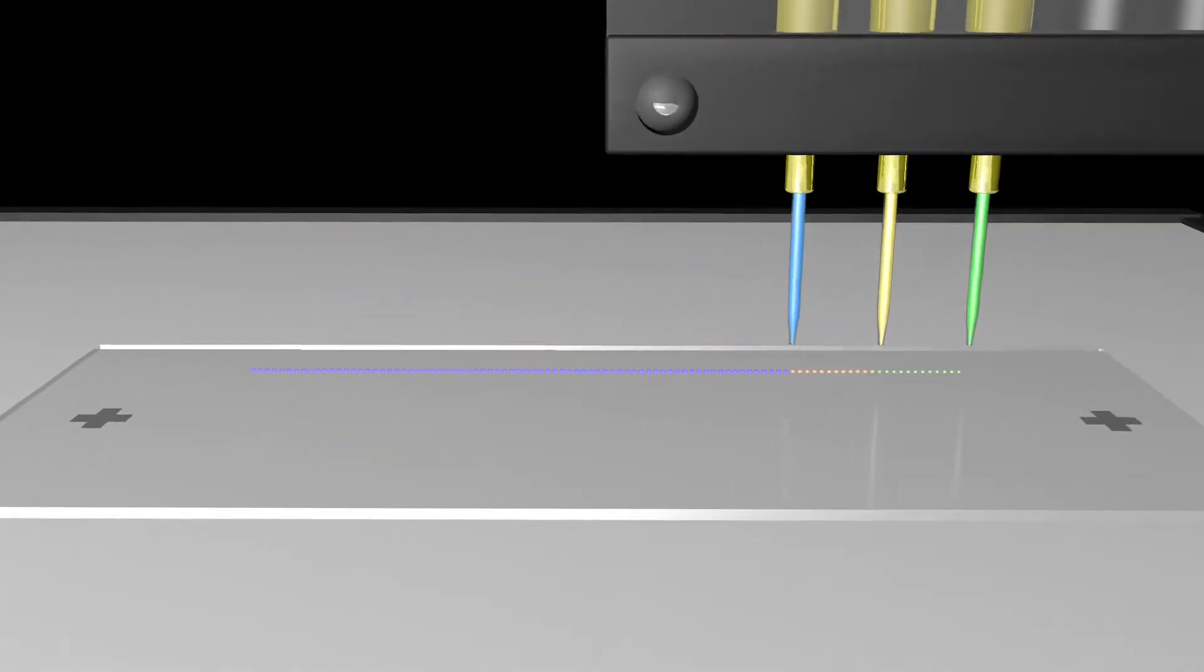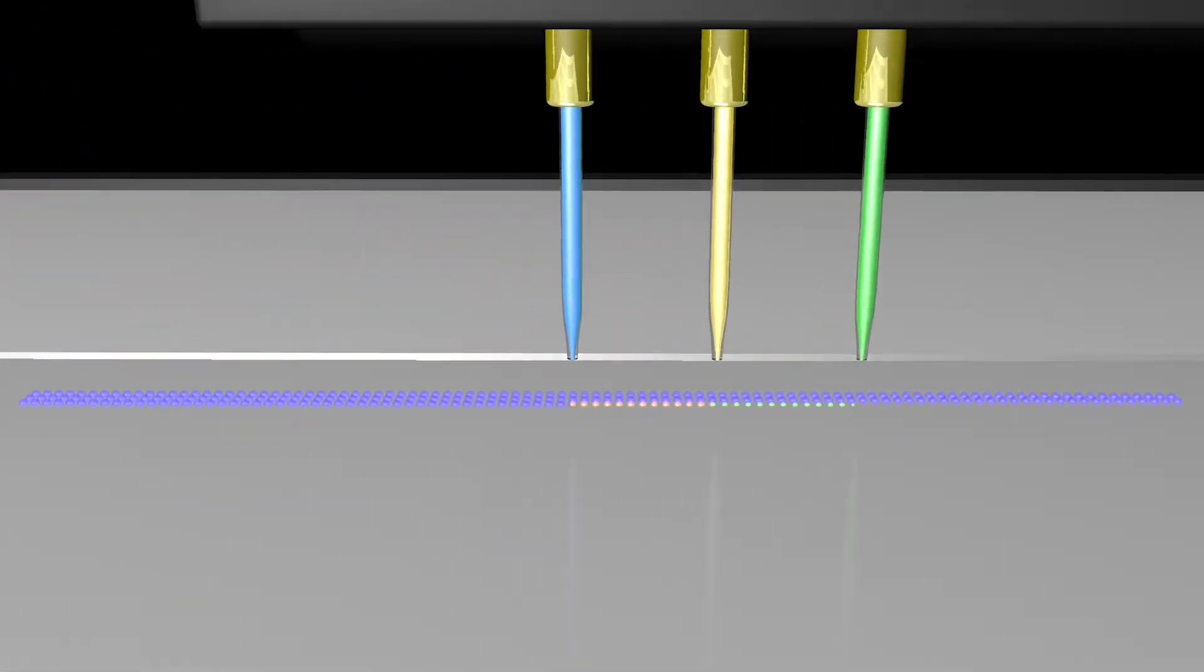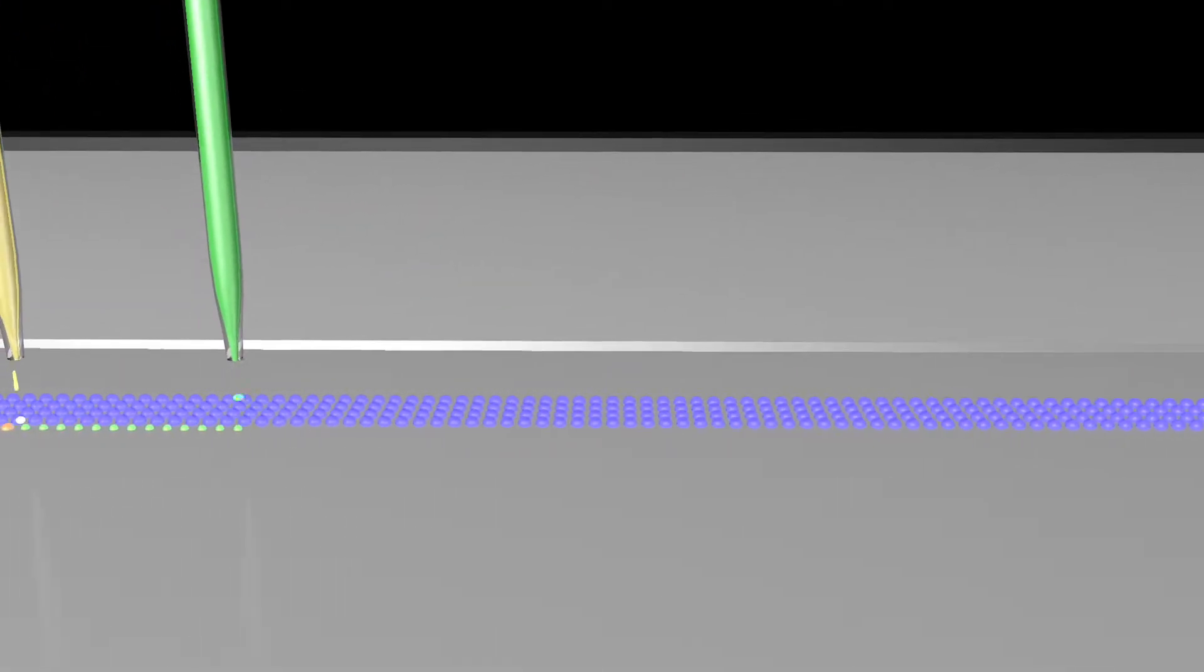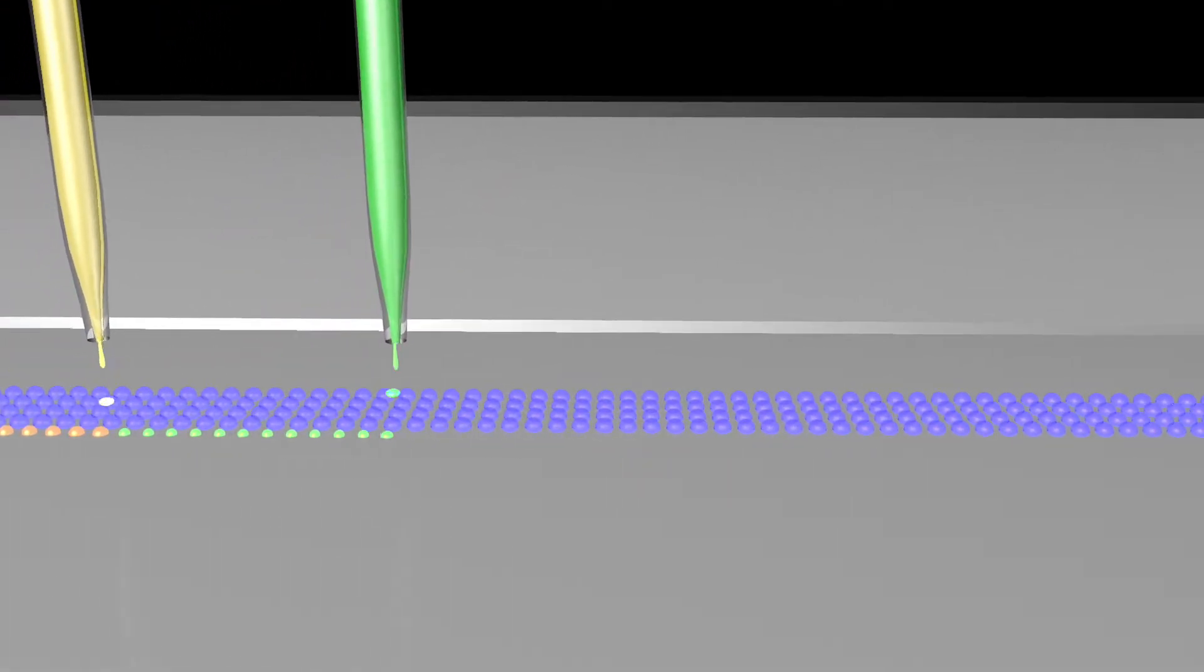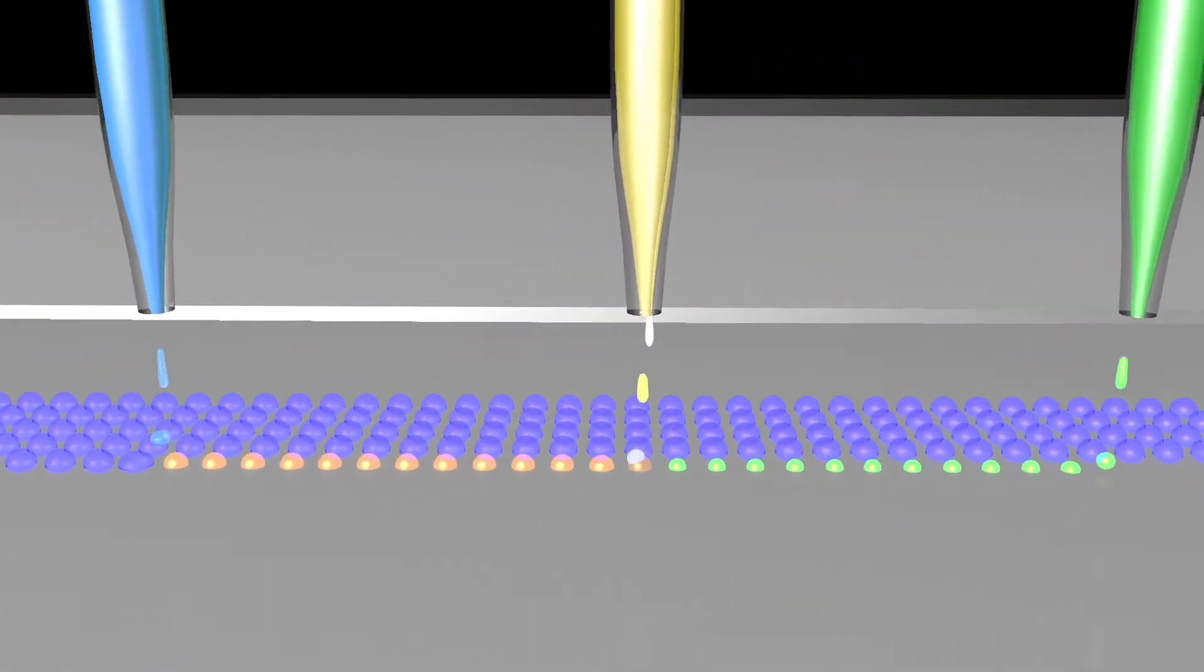onto it with tight tolerances to yield actionable knowledge and maybe someday big profits, well, I'll tell you I'm so glad we met. Because we shoot microscopic biological droplets at objects, targeted with high-powered optics. Piezo cannon hits its mark.